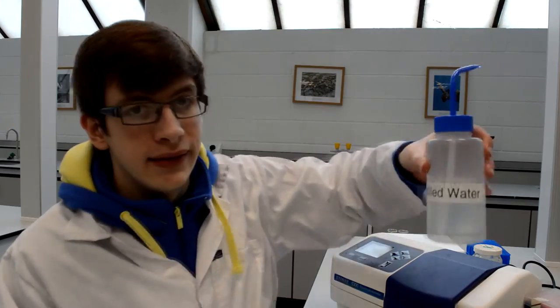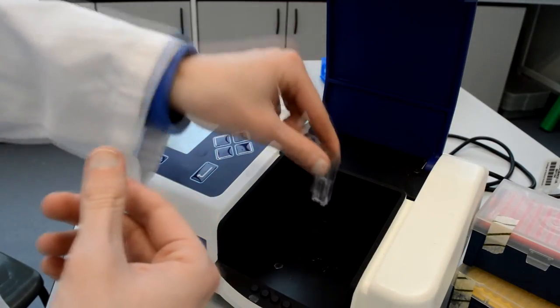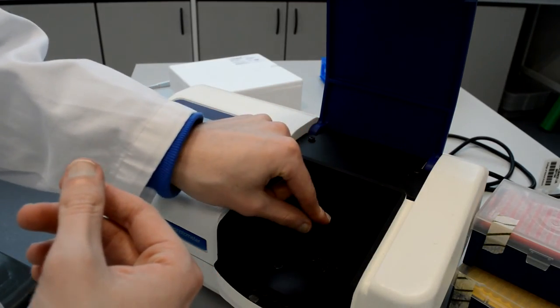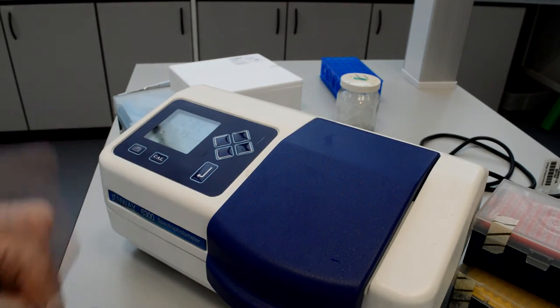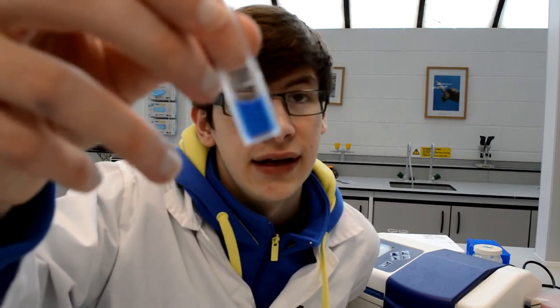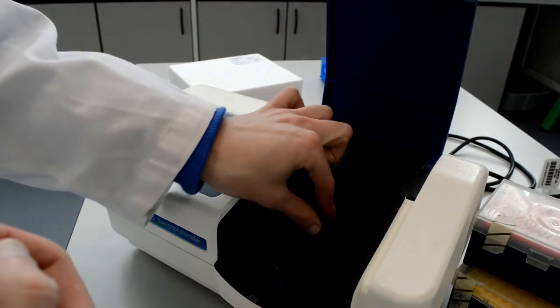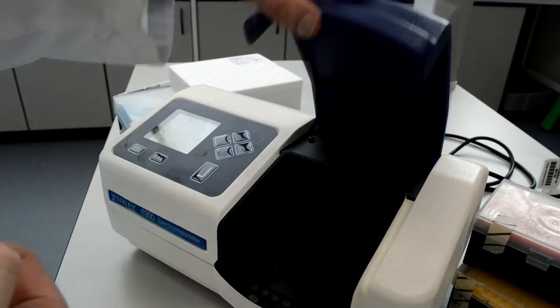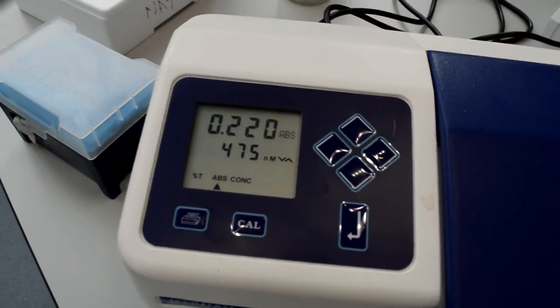Then you need to zero with the correct solution. For the most part, it's just distilled water, like here, this labeled container of distilled water that I have. What you need to do is fill a cuvette that looks like this with the distilled water and push the zero calculate button, whatever it is on your machine. Once you've done that, you're going to take your solution and insert 1 milliliter or 1,000 microliters into a cuvette. Insert the cuvette into the spectrophotometer with the little triangle that you've got facing sideways. After that, all you have to do is close the lid and wait for your absorption to stabilize.